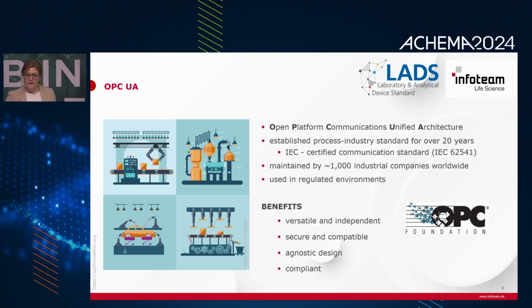The main benefits of OPC UA are its versatility and independence. So OPC UA itself is platform independent and supports various operating systems, like Windows, Apple, Android, or Linux, and also runs on diverse hardware systems, including standard PCs, cloud-based servers, or microcontrollers.